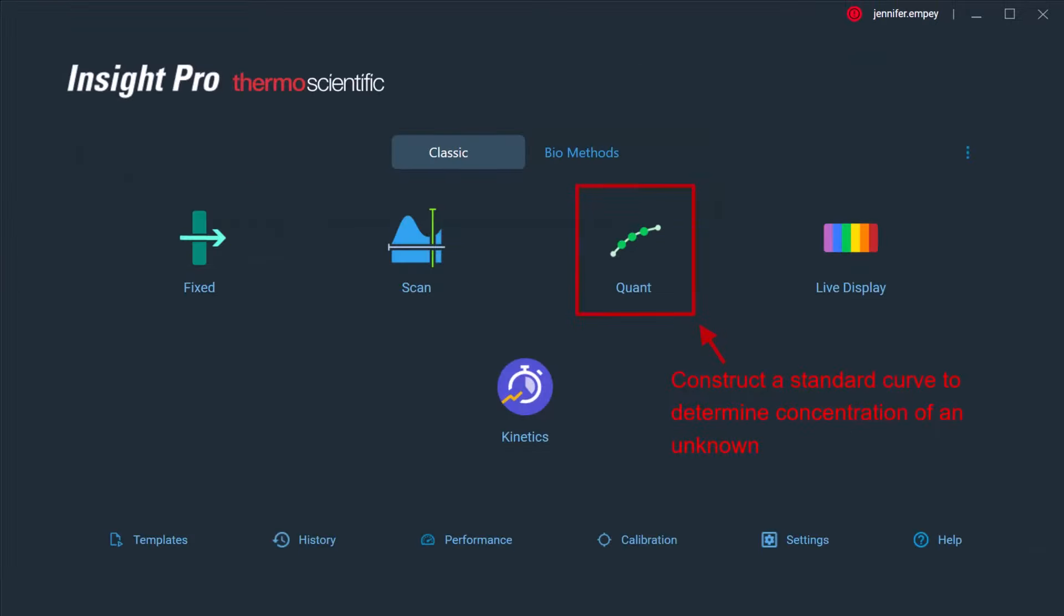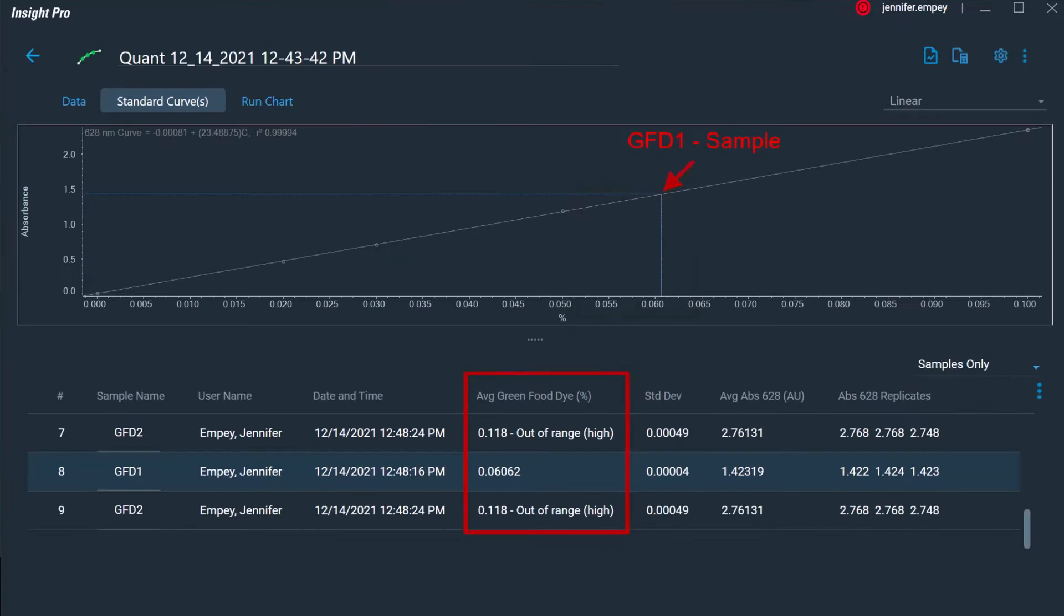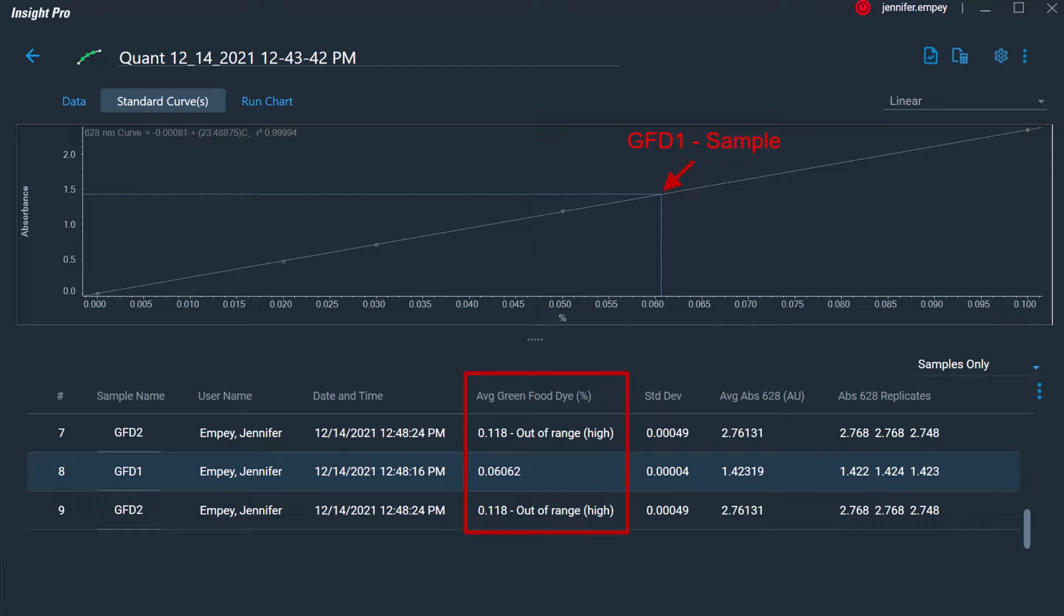The quant application can be used to automatically generate a standard curve using solutions with known concentrations to determine the concentration of an unknown sample. The software will automatically calculate the concentration of the unknown analyte using the defined standard curve and will display an out-of-range warning if the unknown sample absorbance is outside the bounds of the established curve. Additionally, the concentration and absorbance of the unknown sample is clearly displayed on the standard curve.